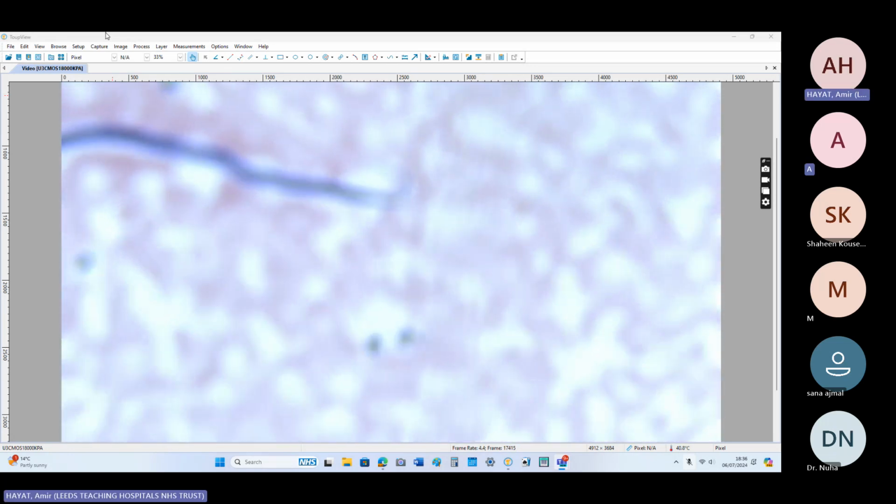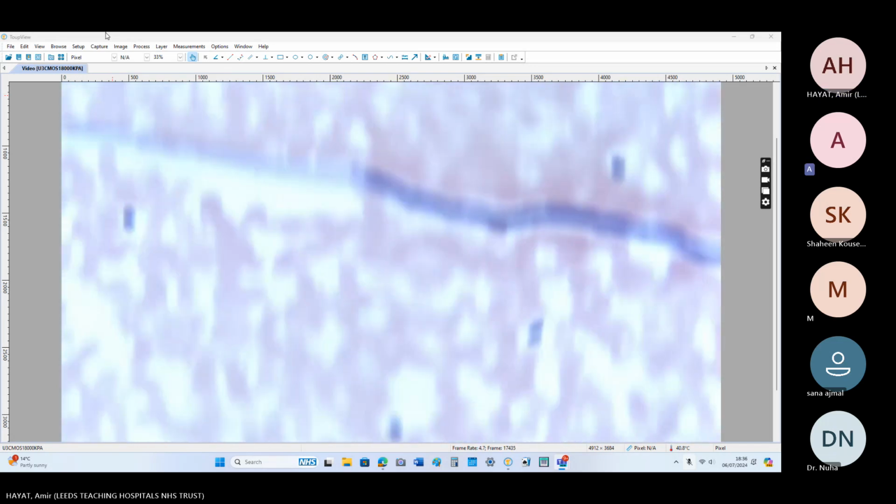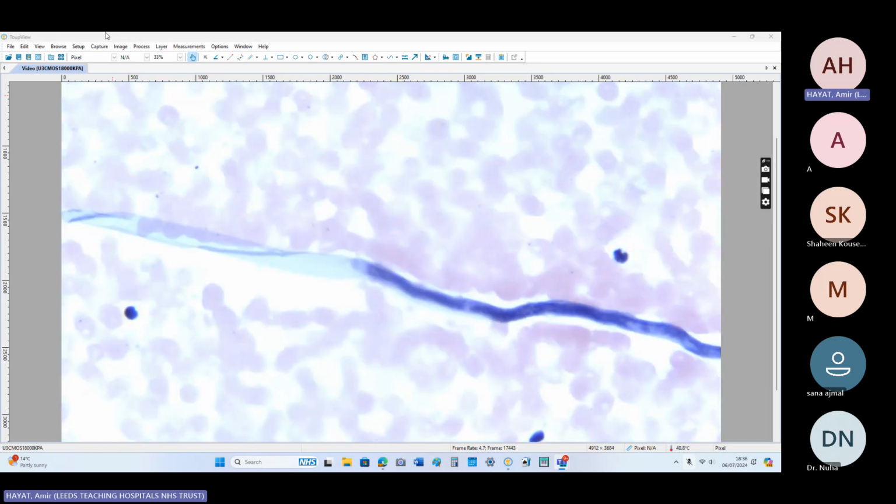First of all, they want to know whether it is a sheath or not. But it is easy to figure out because this worm has a big sheath hanging around here, so it's easy.